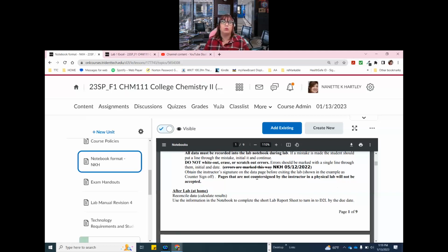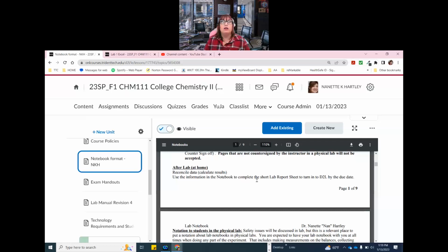And we have to acknowledge that we did it and what day we did it. Okay. The date part is all about who did what first. So we need to have documentation of when these things were done in case two people had the same idea and they have the same data, and then we have to see who actually had the idea first because they're the ones who get credit for it. Okay, so that's what that all comes about from.